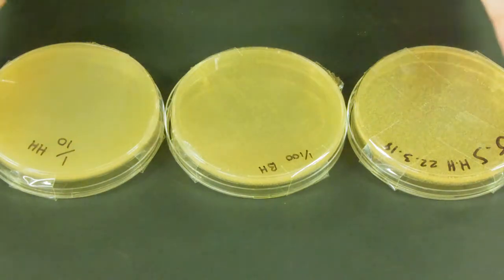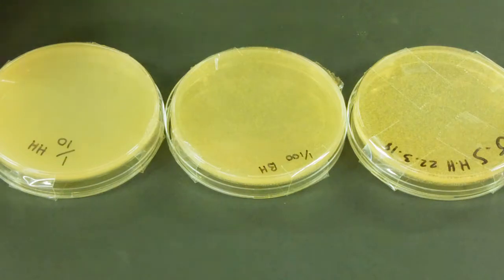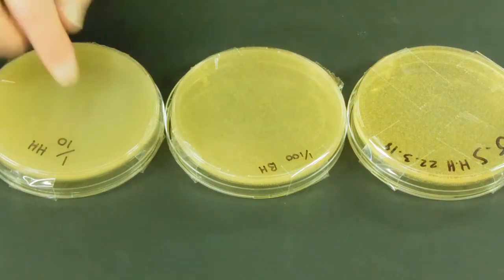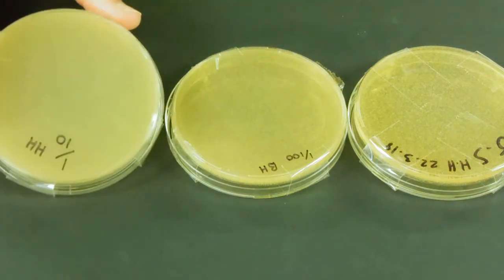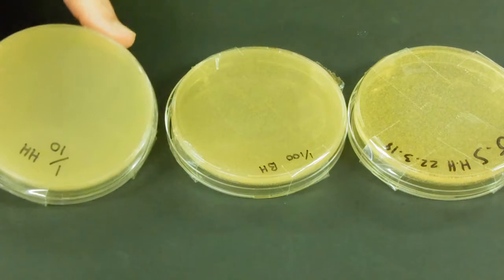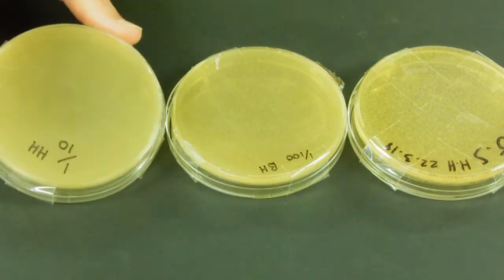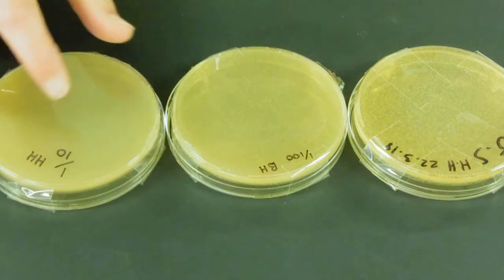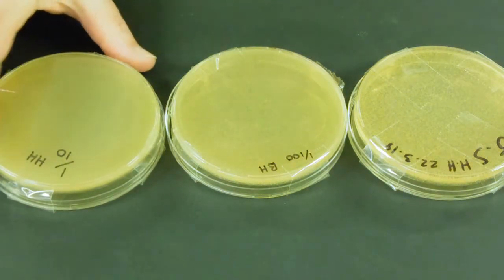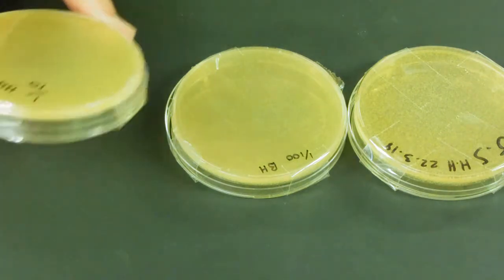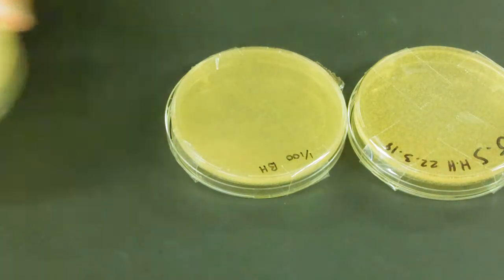These show pretty perfect sequence of results. The reason that we do serial dilution is to spread the bacteria out so that we can count them. On this first plate, this one in ten, you can see that's really quite a uniform shade of dark yellowy cream. That shows that there's full coverage of the bacteria across those plates. Well done to Hamza and no contamination, super duper.